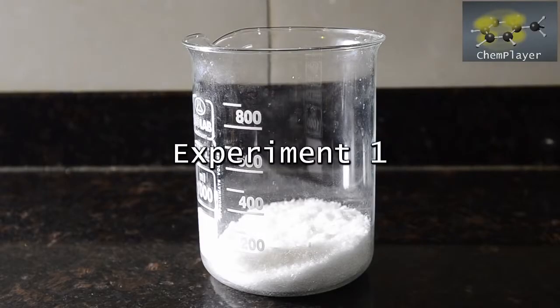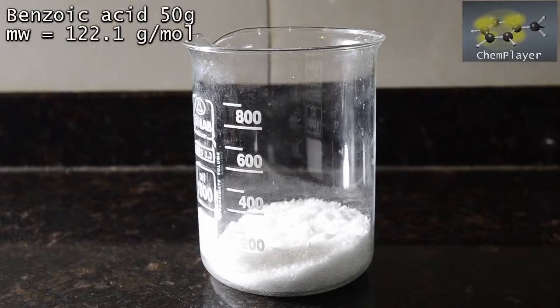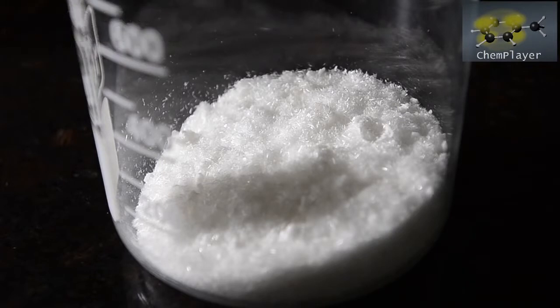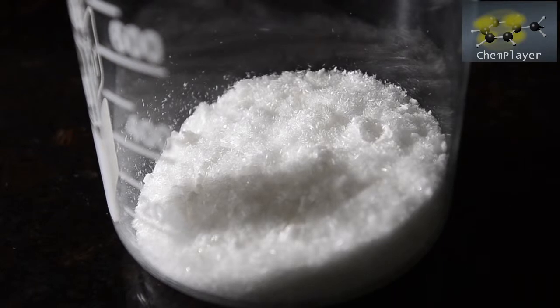Okay, here's 50 grams of benzoic acid which we prepared from sodium benzoate food preservative, acidifying it with hydrochloric acid and then recrystallizing it from boiling water. It's a white crystalline solid as you can see here. We're going to try to do our reaction in a slightly ghetto style, and we're going to use calcium hydroxide to convert the acids into their calcium salts in the same flask that we react them.